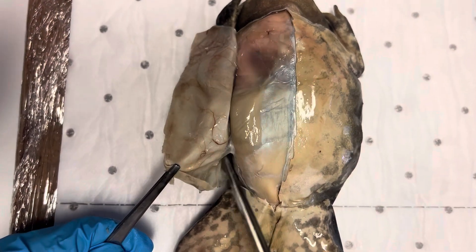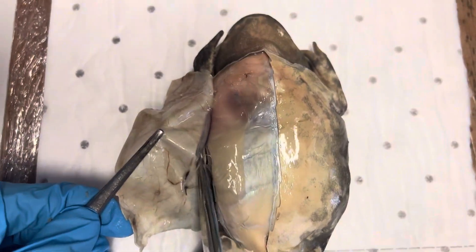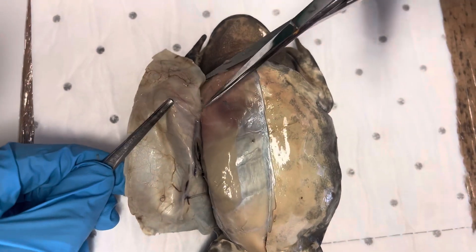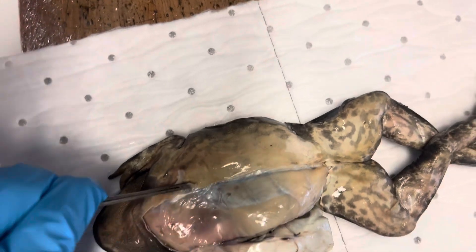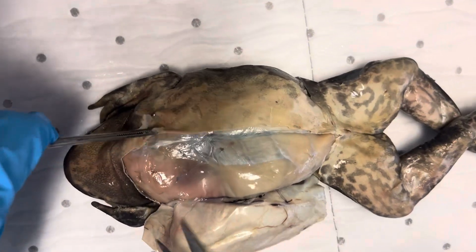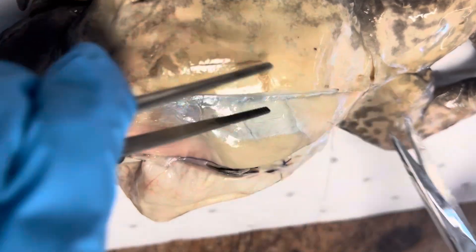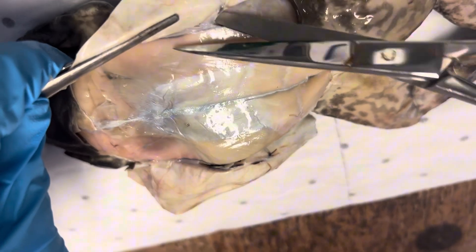And then we can take the skin away from the side — you can see all the blood vessels in the skin. Same on the other side, down the leg, down towards the arm. Generally you can just peel it away. If it's been fixed it's quite fragile, so there's not an awful lot of cutting that needs to be done. Turn it round.